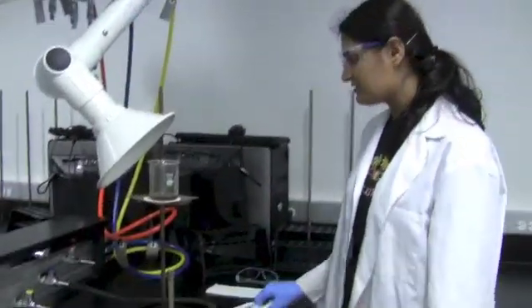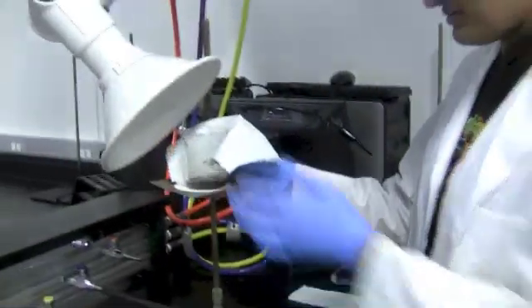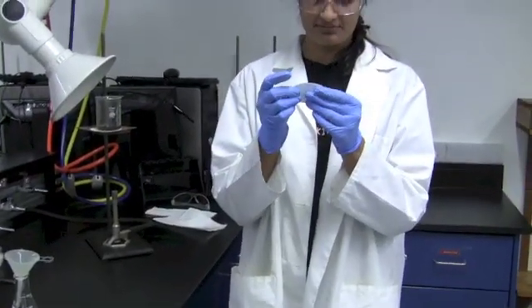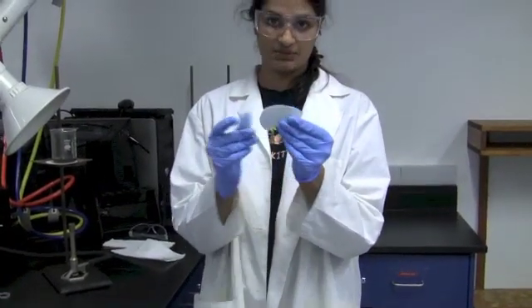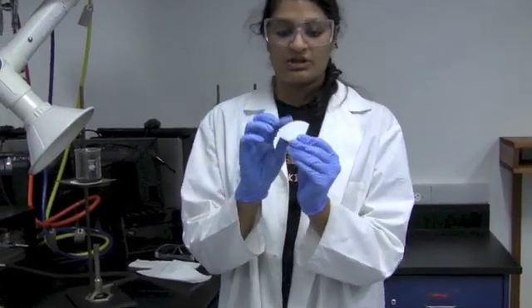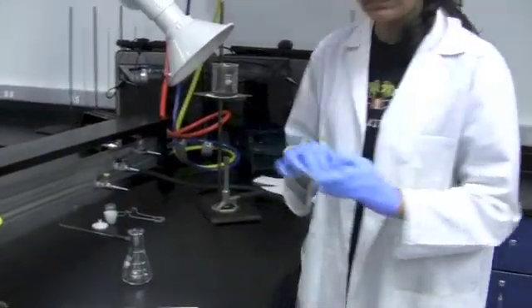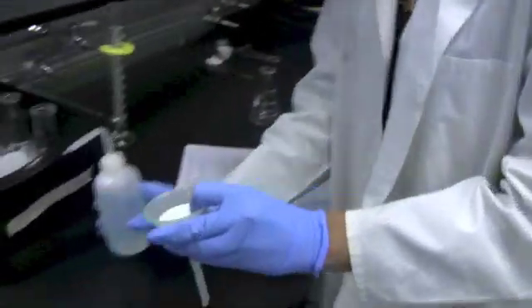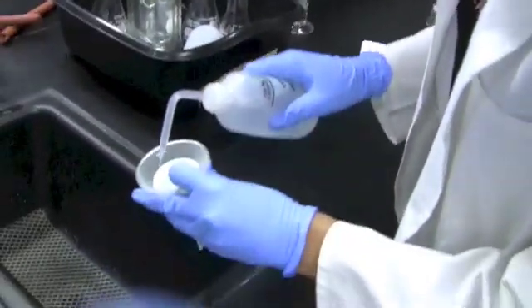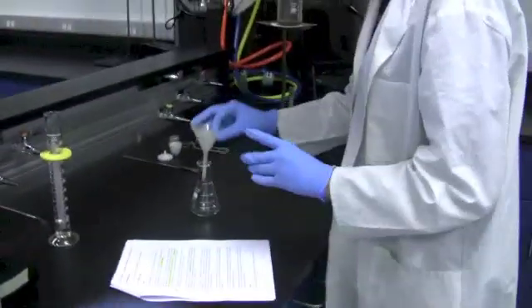Now once your aluminum dissolves, you might have some black particles remaining. They're going to look like this. To get rid of these, you're going to want to filter them out. Now you're going to take some filter paper, you're going to fold it in half, and fold it in half once again to form a cone shape. You're going to open the filter paper and place it inside your funnel. And to get the paper to stick to the funnel, you're going to take your wash bottle and just lightly wet the edges.